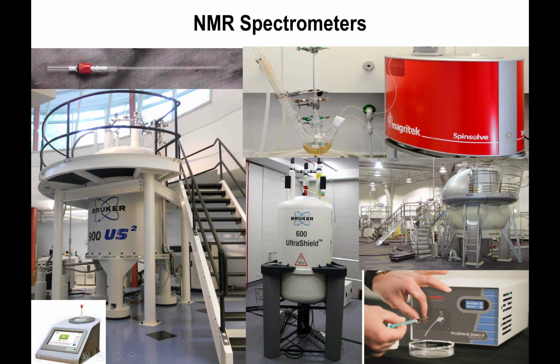In fact, the one right here, this Varian one with 1 gigahertz worth of frequency, which correlates to the magnetic field, is pretty huge, and you can see you have staircases to get to the top to add your sample. Other ones are a little bit smaller, like this 600 megahertz. And then there are some benchtop instruments that make it a little bit more convenient to house the instruments in a laboratory and do the experiments. But you sacrifice a little bit of precision and spectral detail by using lower magnetic field instruments.